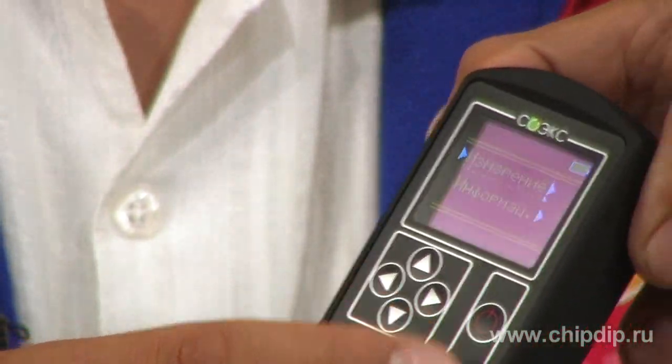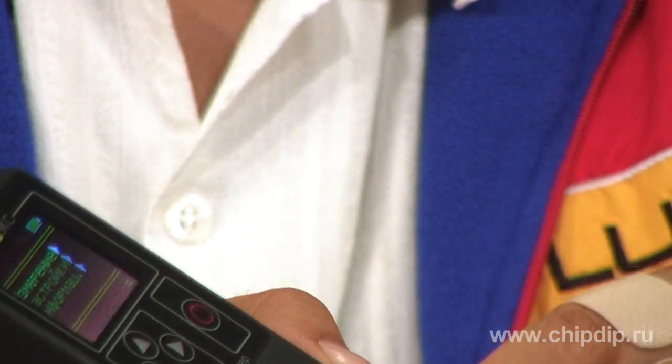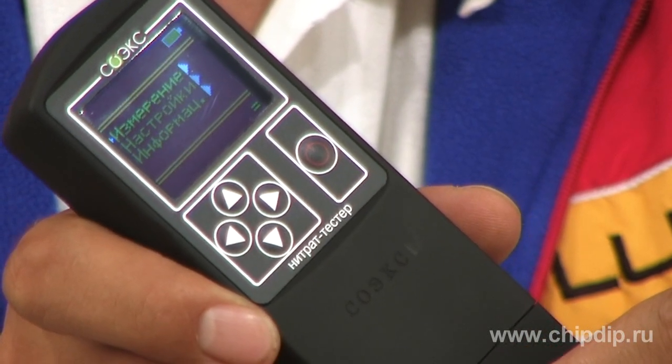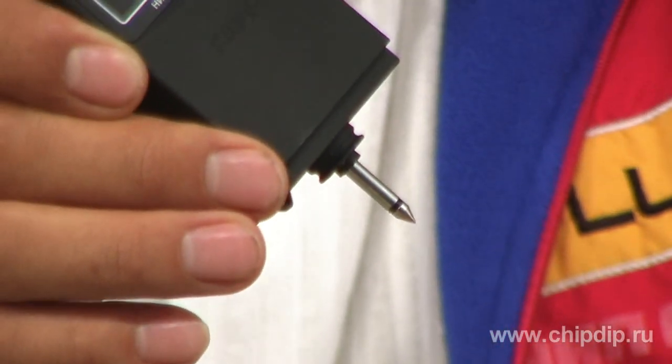The display resolution is 160 by 128 pixels. There are five control buttons below the display. A sharp probe is at the bottom, provided with a security cap.